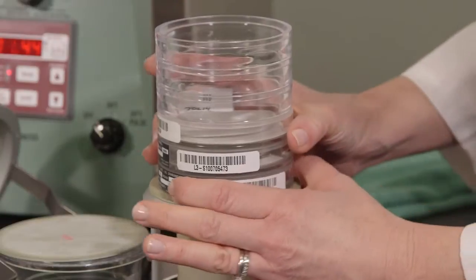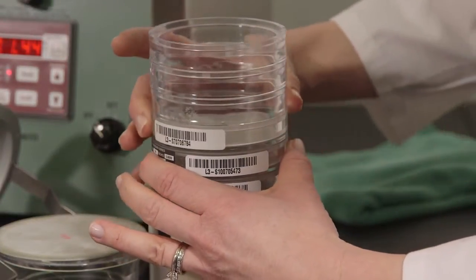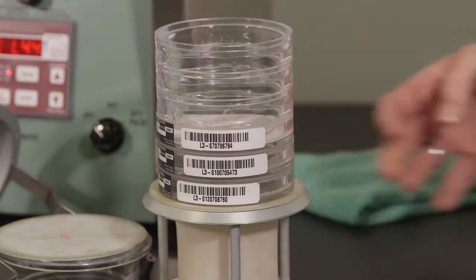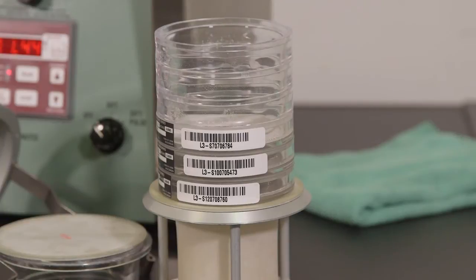For ease of sample viewing, align the sieves so the labels are all on one side. There is room for up to 6 standard series sieves, or 3 electroformed.